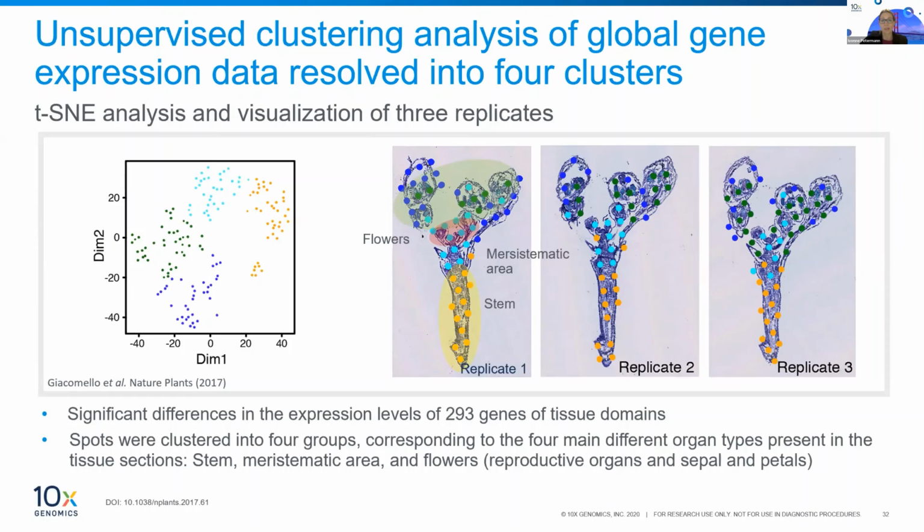This is really quite exciting to see the outcome of this, and that this works in the plant setting. They've used 3 replicates here, which I think for plants specifically, it's recommended to do replicates. But the discussion about replicates, how many samples, is something we can have offline with anyone who really wants to get into this.